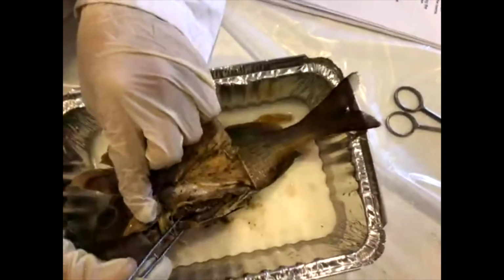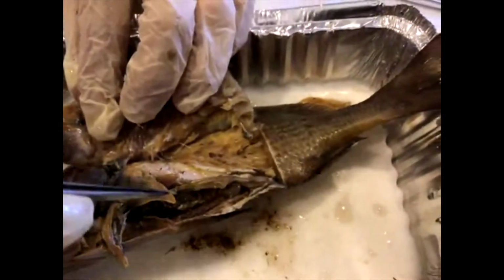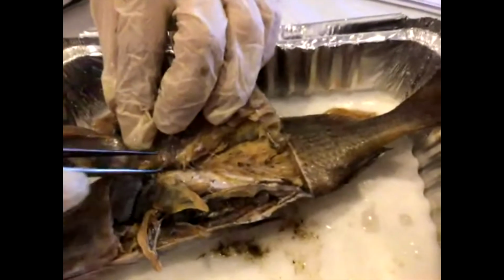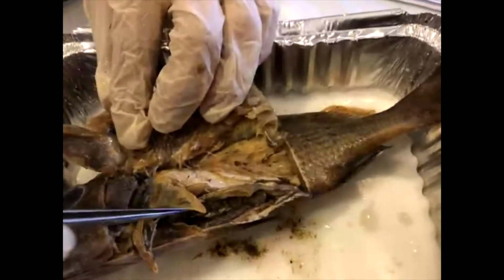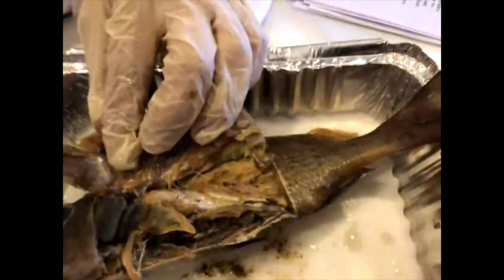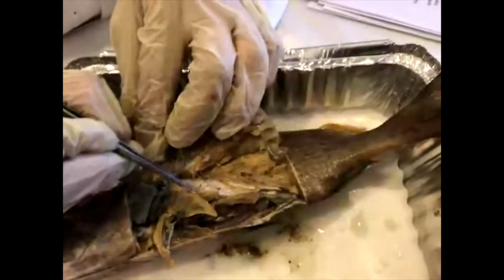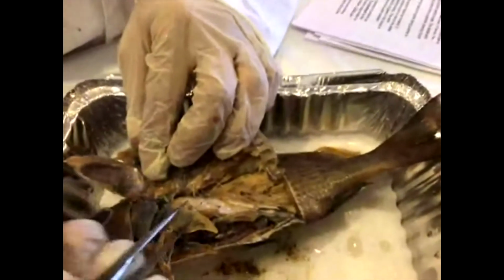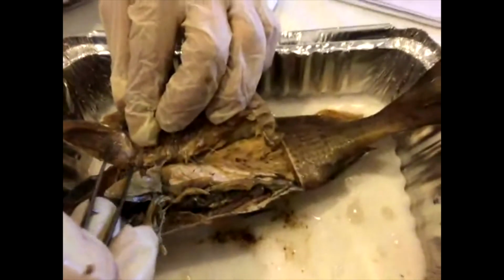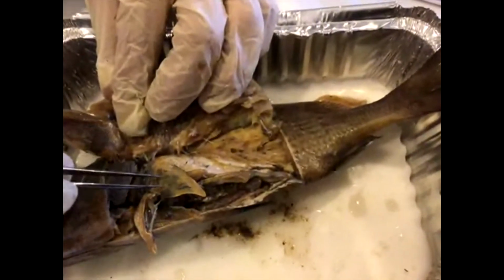So first off, this lobe that we have is something that humans have, and it's probably one of our most important organs. It does so many different things. This is the liver, and it looks a little bit like a lobe, and it's funny, this liver actually looks quite similar to what humans have. We have multiple lobes on our liver, so you might see two sections like this, but this is the fish's liver. It looks like it only has one lobe, and it helps filter the blood.